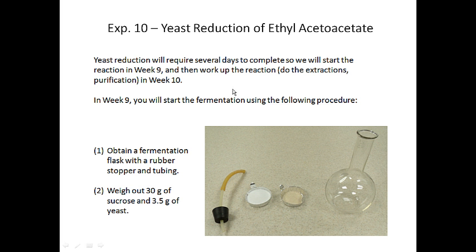But it's going to require that we start the reaction in week 9, which is the one that is upcoming as I'm recording this. And then we do the purification and what is called working up the reaction. That means doing all the extractions, the purification, and the analysis in week 10. So this is actually the week 10 experiment that we're just going to start in week 9, while you either have or are going to wait for your reaction to reflux for 45 minutes.